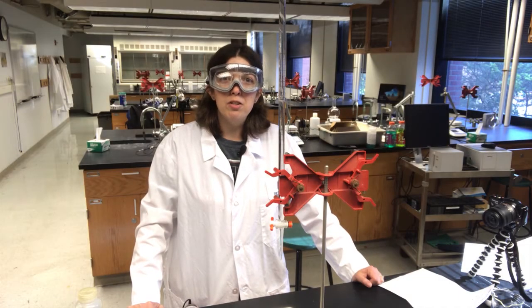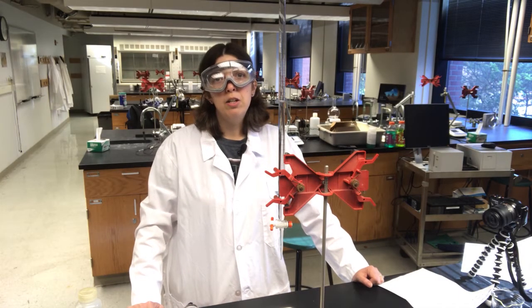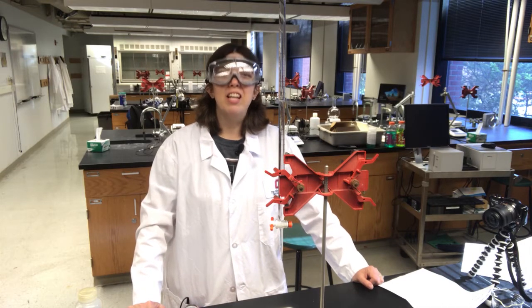Today I'm going to show you how to do a titration with an indicator for determining the endpoint. Get your goggles and let's go.